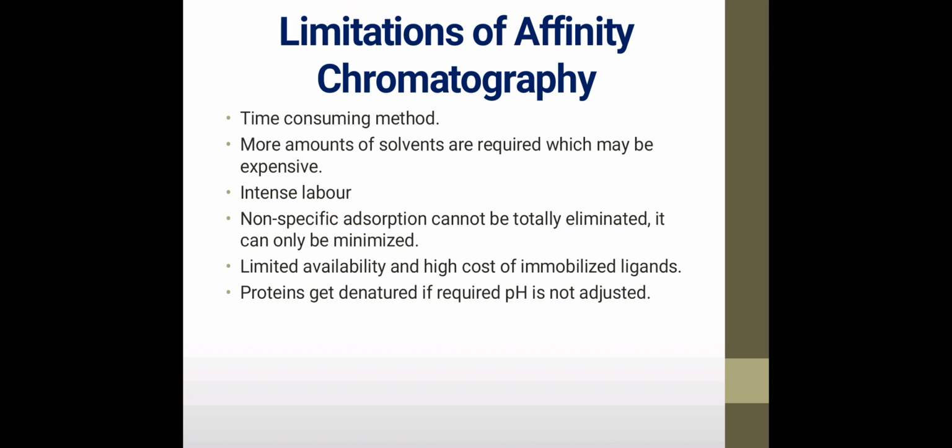Overall, this affinity chromatography is very much useful for the separation of biological compounds.